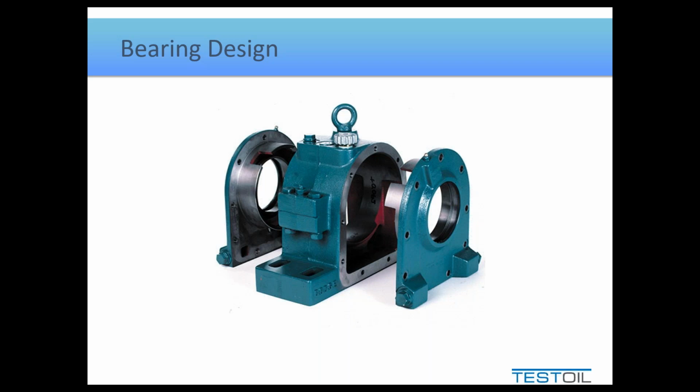Now, I'm not saying it took 3 years to manifest, but at some point over the course of samples, I'm guessing right before the last sample that we were looking at, that was the catastrophic fail sample, but after the sample that was beforehand, somebody re-greased those seals. And in that event, in those roughly 6 weeks that transpired, that was when the failure actually took place.